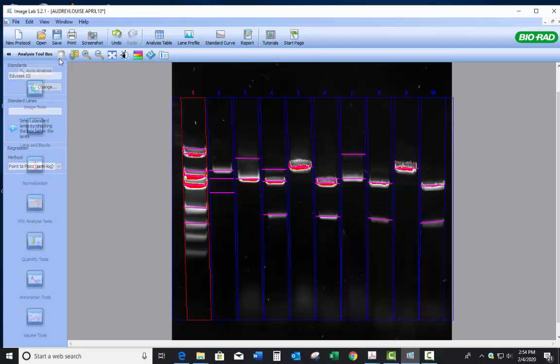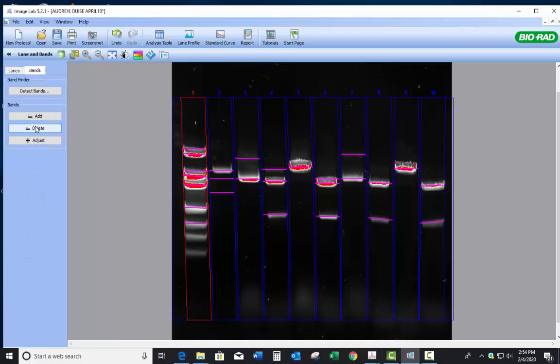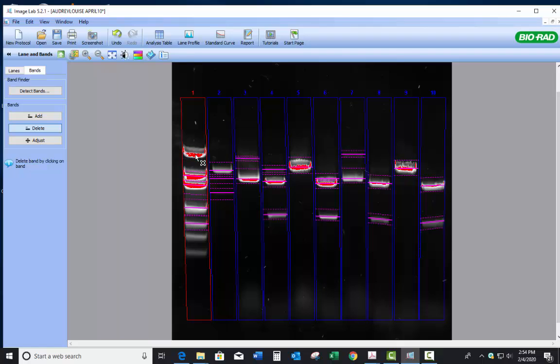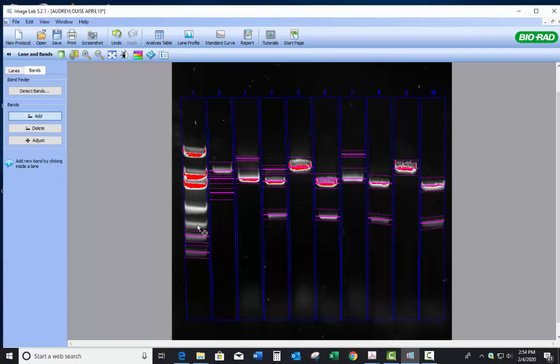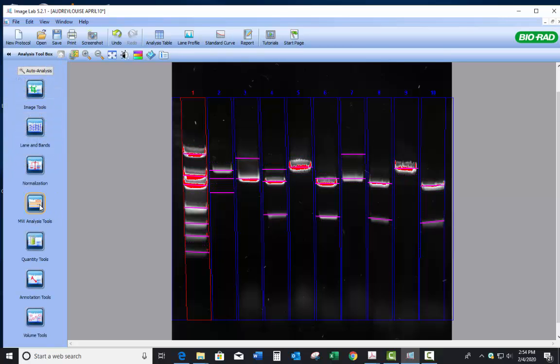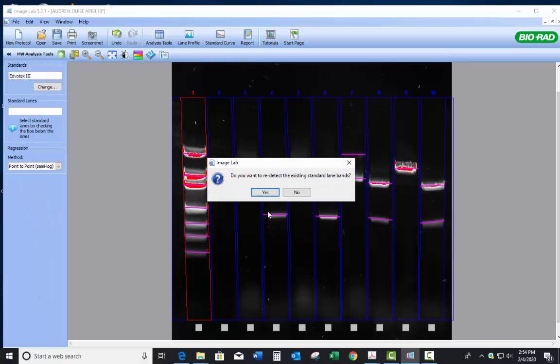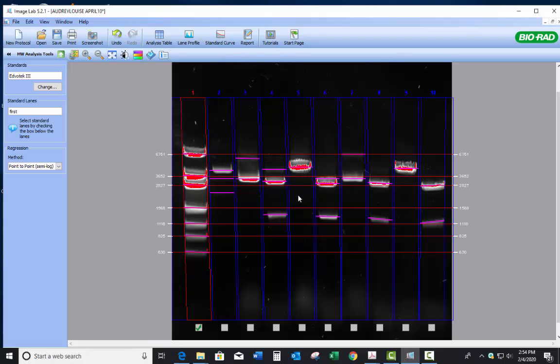I'm going to go ahead and go to the lanes and bands. And I'm going to delete all these in here. What's going on in there? So I would agree. Let's undo that. So I'm just going to do this manually. There's one there. There's one there. There's one there. There, there, there, and there. And so you'll need to go through and adjust like this one. You need to bring up higher, right? So make sure you do all that adjustment. And so now if I go back to the molecular weight analysis tool and I select this, I'm going to hit no. And so there we go. So now it's accurate.